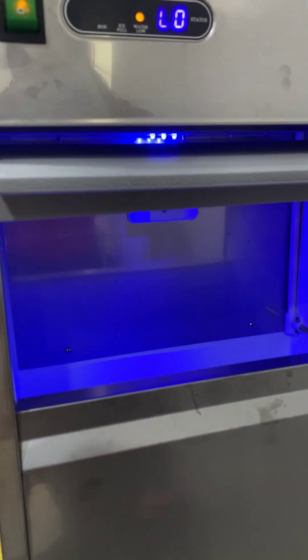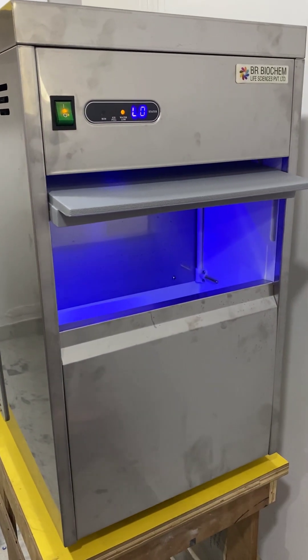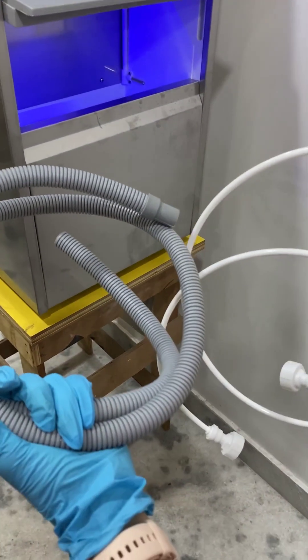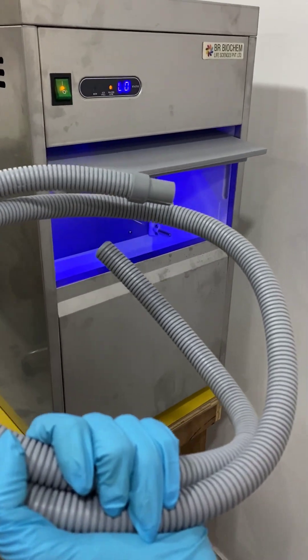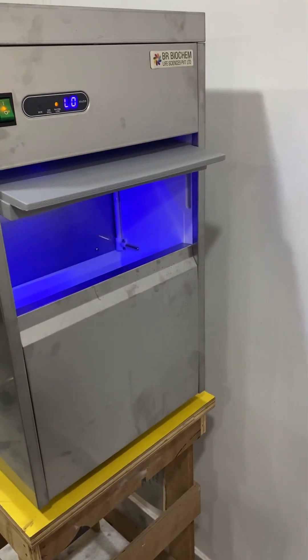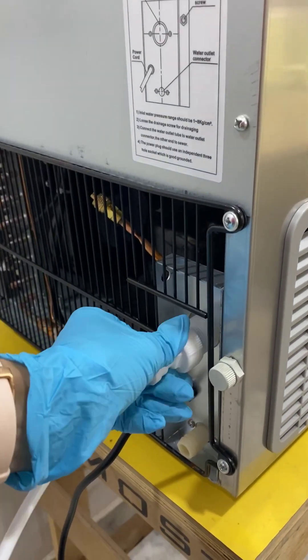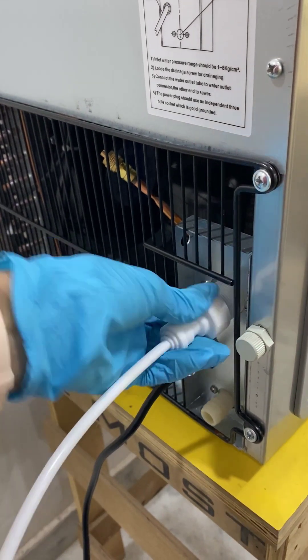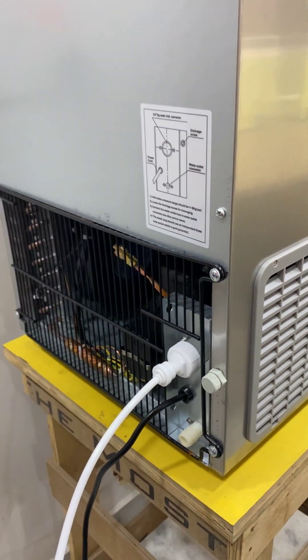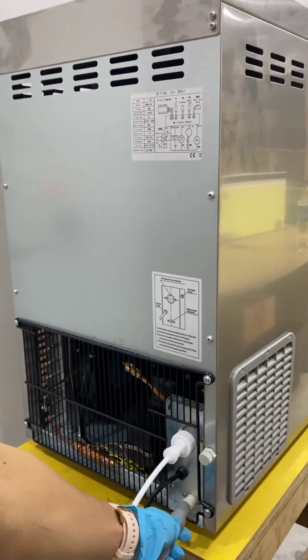The compressor used in this machine is R134A. Some accessories also come along with this machine — this is the water drainage pipe, this is the water inlet pipe, and this is the scoop. You can set the water inlet pipe by moving the screw anti-clockwise, and for drainage, set this drainage pipe accordingly.